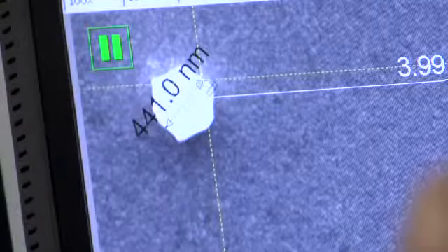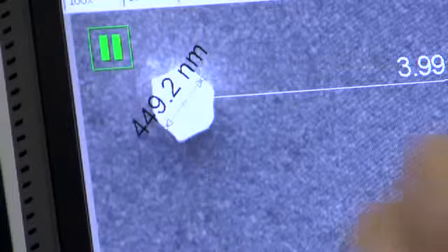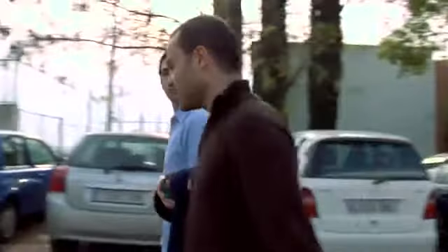Not only is he able to see the tiny spots where crystals have formed, he can also determine the shapes, sizes, and orientation of these crystals to better understand the way they assemble. We can really control the reaction on each one of these droplets. It's a significant success, one that has major potential for future technology.